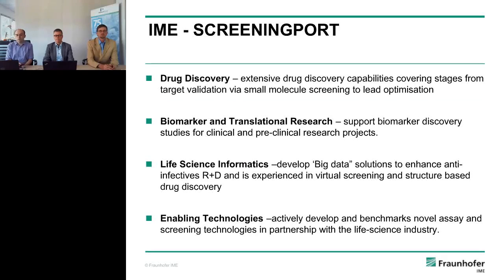So just a quick note on the ScreeningPort and the IME. Our main activity is involved in small molecule drug discovery. We have 500,000 compounds in our library, a number of automated screening systems, including some from PerkinElmer.